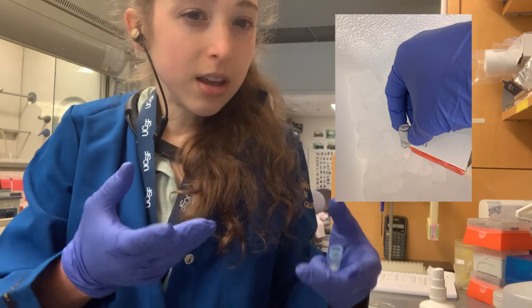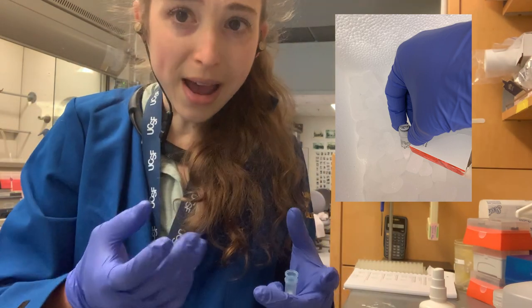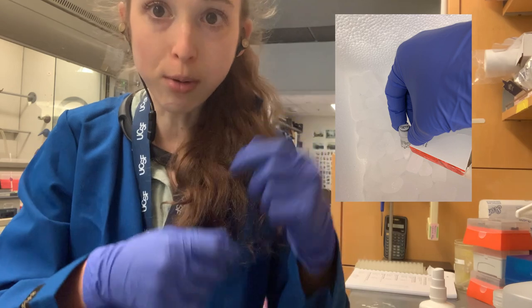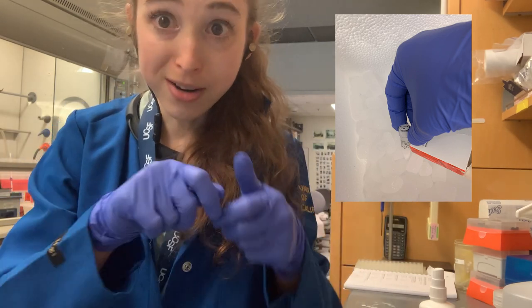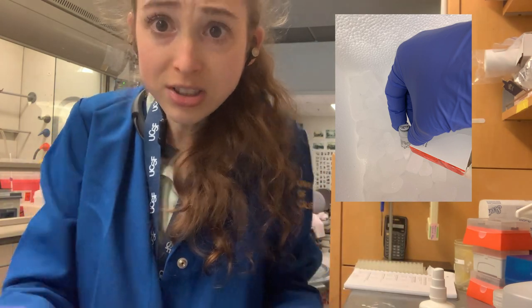Even if it's not a screw lid, if you have a box of tubes, you don't want to be pulling every tube out — especially when working with sensitive enzymes. Typically, when tubes come with a blank top, and often the tops are actually flat, it makes you think: why didn't they put something there so you can write on it?